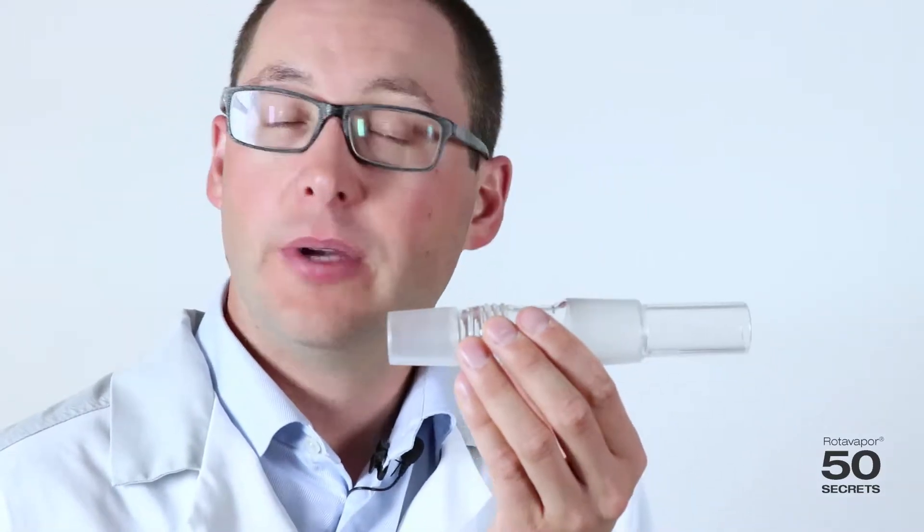Today's secret is all about vapour ducts. We have different vapour ducts for different purposes. We remove the combi clip just for simplicity. That's the standard vapour duct.